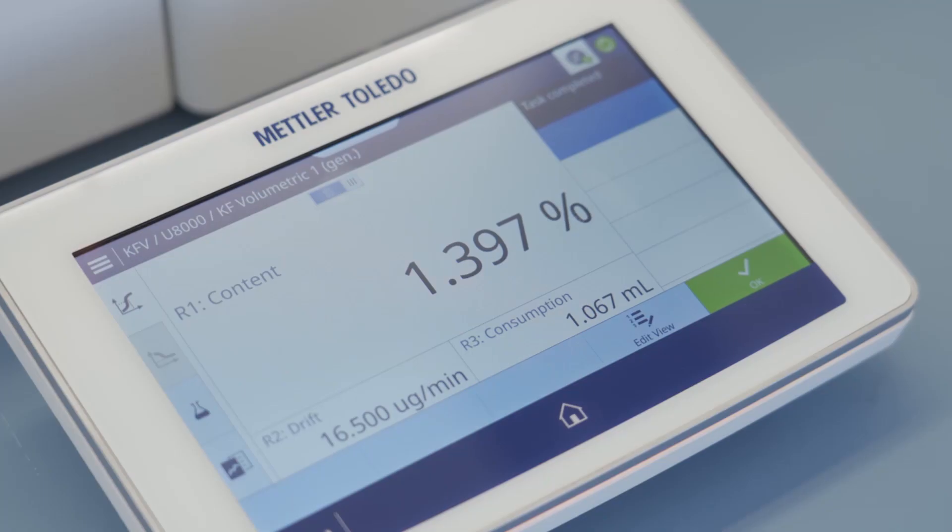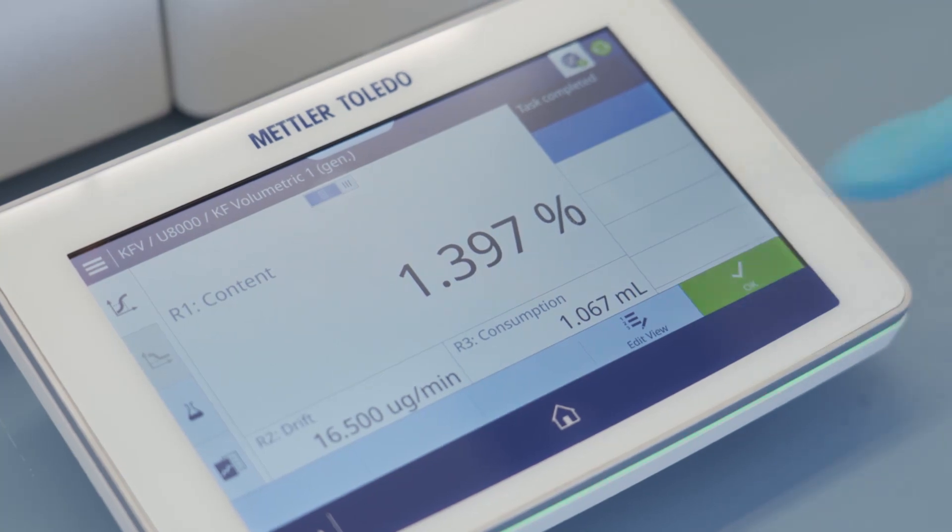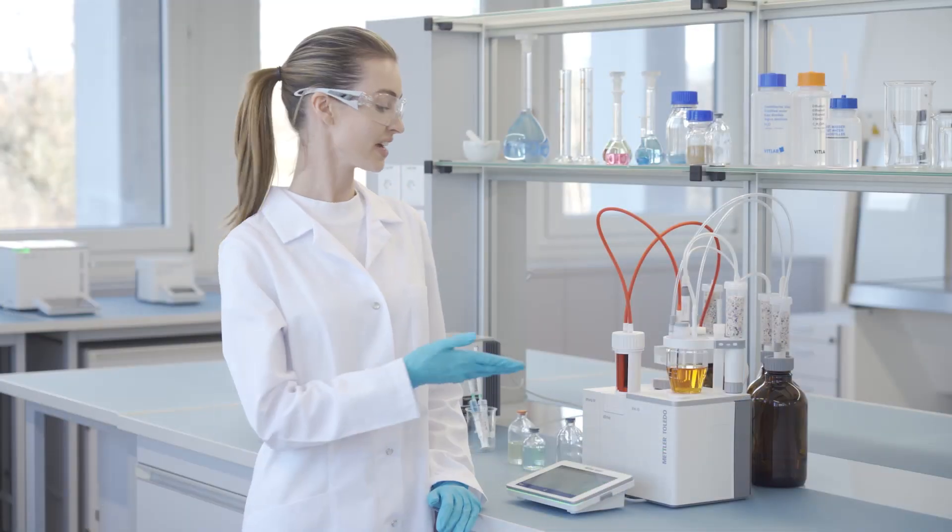And here I have my results in a very short time. Let me tell you more about how the EVA titrator offers speed and reliability, with its Fast Forecasting and Parametric Control Algorithm, or FFA for short.